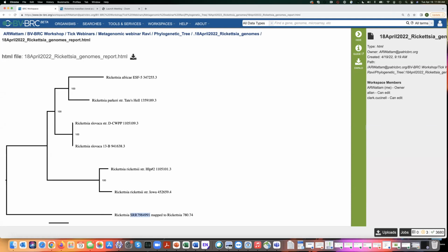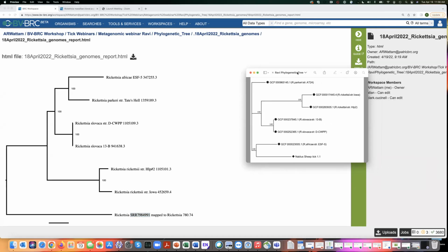So there are a few more questions. Sorry to keep interrupting, but I just want to make sure we don't go too far. Sure. There was a question from Kingsley asking: I was expecting the accession numbers as part of the data pulled up to be sure they were the same data, especially when you select exact terms. So why weren't they? Oh, why did I use different accession numbers? Because I realized after that, when I found this particular genome, it should have been GCA.